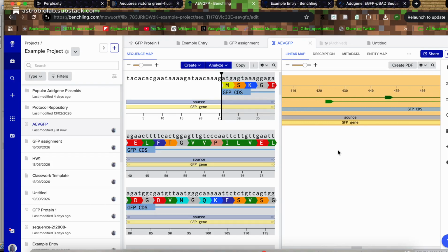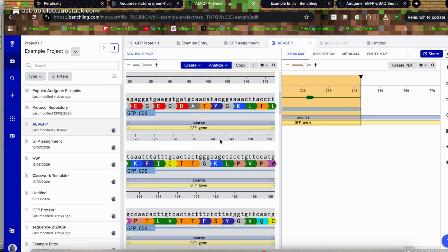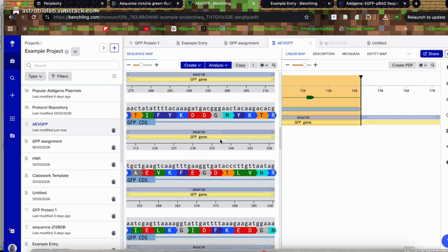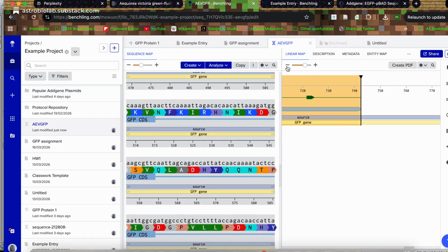Yeah. So this is all that you're trying to do. And what I want you to be able to do is see the DNA sequence together with the protein sequence so that you can make sense of the actual protein, and then be able to look through for stop codons. So I haven't mentioned them. I want you to scan this sequence to find where the possible stop codons are.